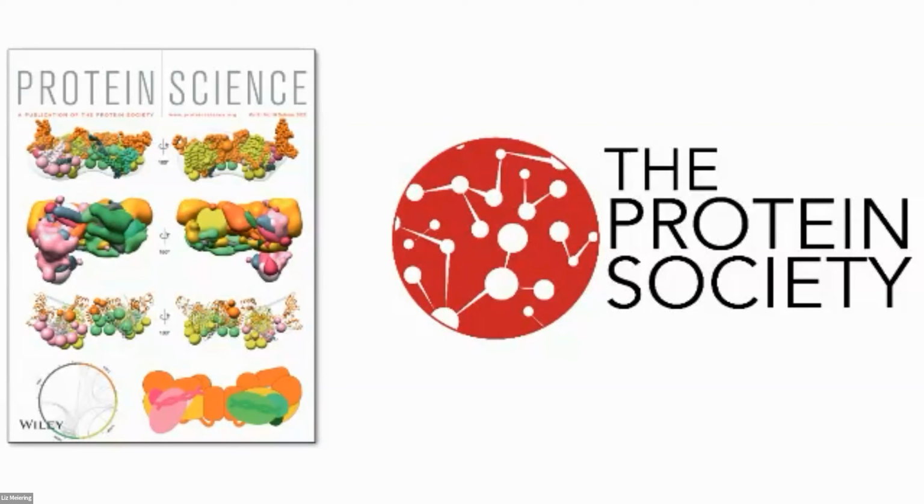So that's a few loaded questions there, but the amyloid aspect and in vitro versus in vivo. Right. So, we were not specifically looking for amyloid. One of the hypotheses in the phase separation field was that these condensates in vivo, because many of them rely on highly disordered domains of proteins, which are known in neurodegeneration to contribute to the formation of amyloids. One of the hypotheses was maybe at the molecular level, this supramolecular assembly could arise from amyloid-like interaction, right?